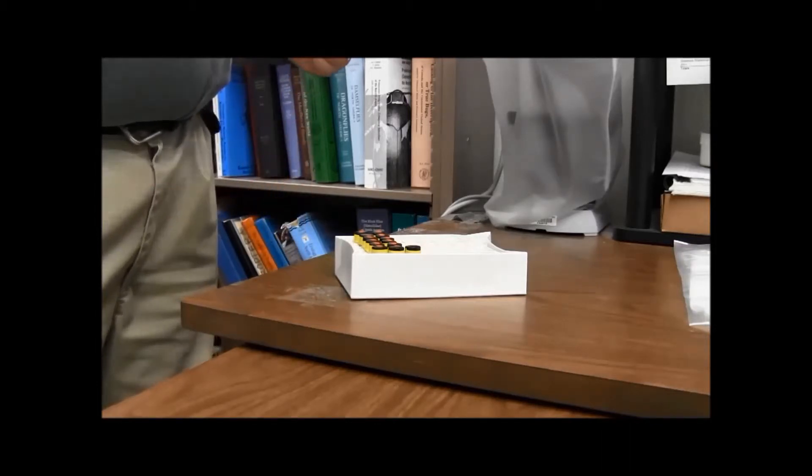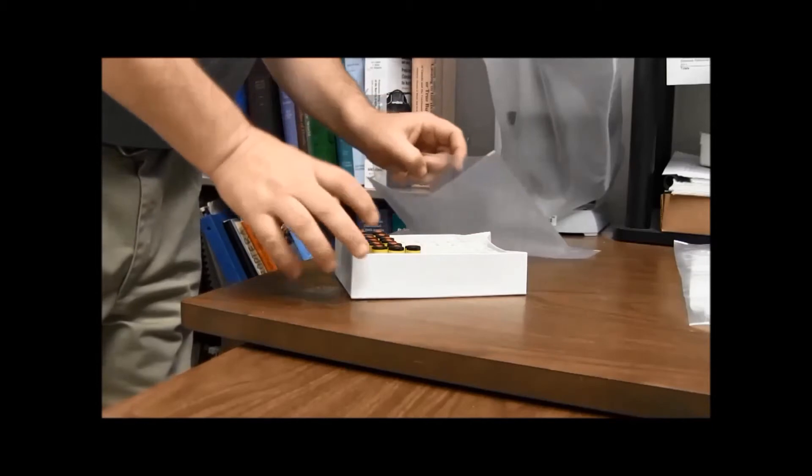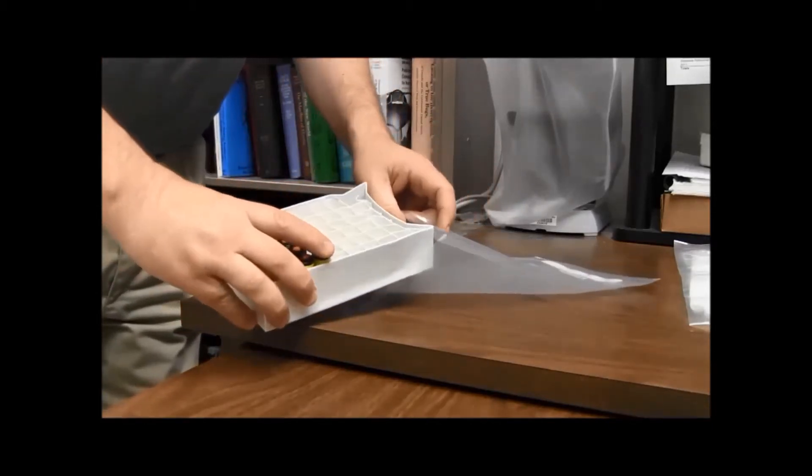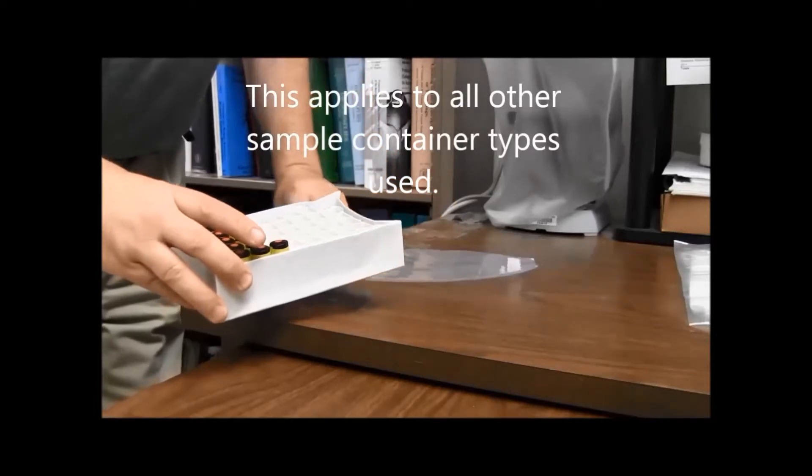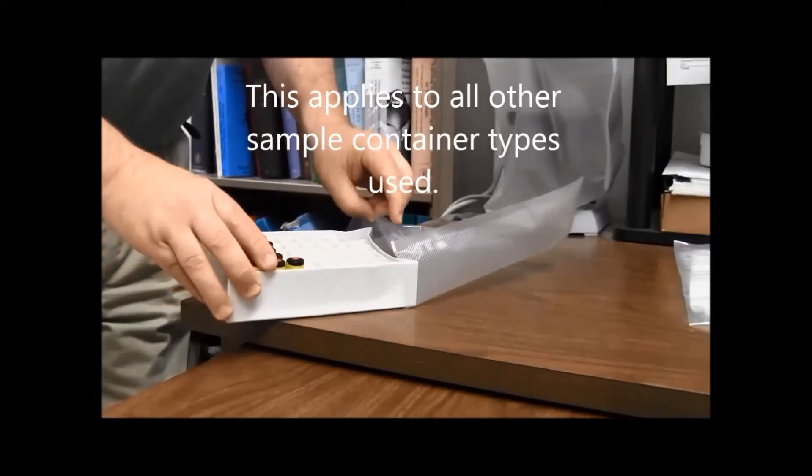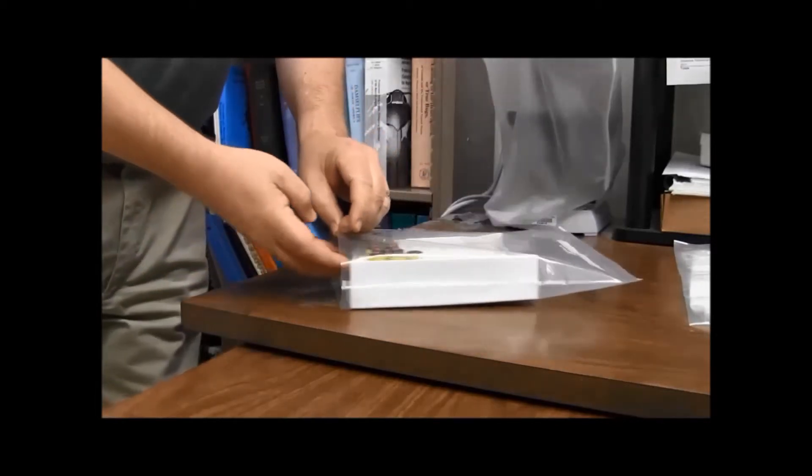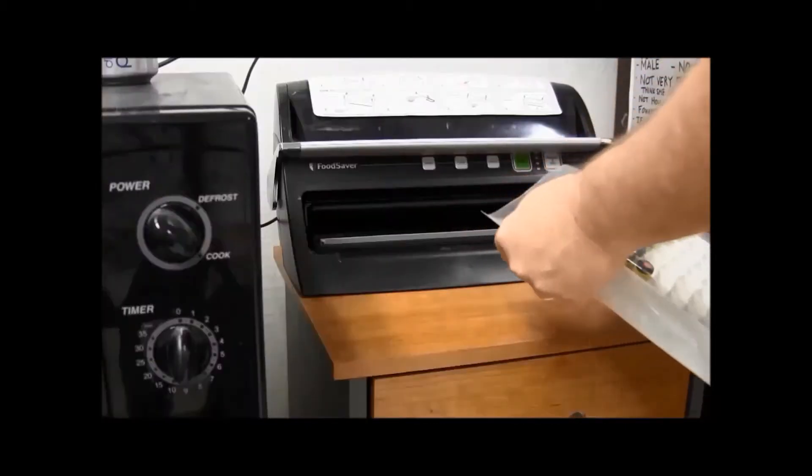First step is you are supposed to heat seal your vials so you can put them in the vial tray or there are other ways of binding vials together. We found this is a nice convenient way of doing it. So this is the machine we use.